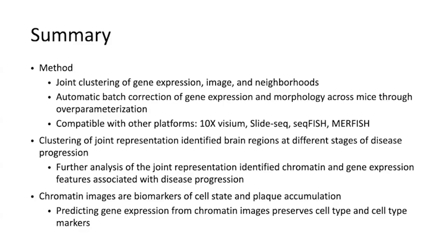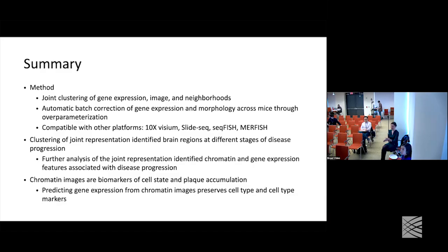Thank you so much for a wonderful talk. One of the things that often comes up as we're preparing single cell or single nuclei data sets is that sometimes, for the initial sample taken for the RNA sequencing, you don't know exactly which face of the tissue sample it came off of. Then you try to cut your slice for your RNAscope or whatever off of the same face, but it might actually be a totally different aspect of the tissue, which could have a slightly different cellular composition.